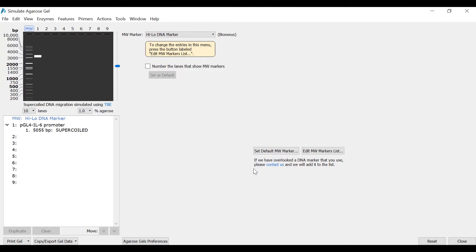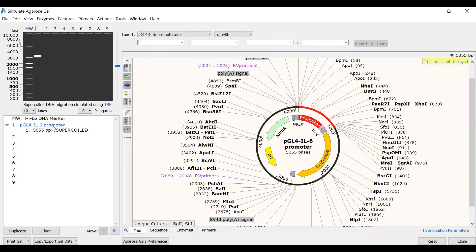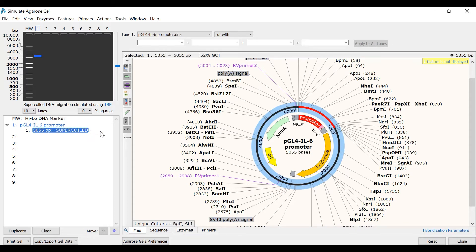Molecular weight markers have their bands automatically labelled on the simulated gel, so you can easily interpolate any DNA band sizes. The pGL4 plasmid I had open is automatically placed in lane 1, and since this is a circular plasmid, the initial result shown is that of supercoiled DNA. Migration of supercoiled DNA is known to behave differently in different electrophoresis buffers, so SnapGene allows you to change the buffer used in the simulation to align with your experiment.